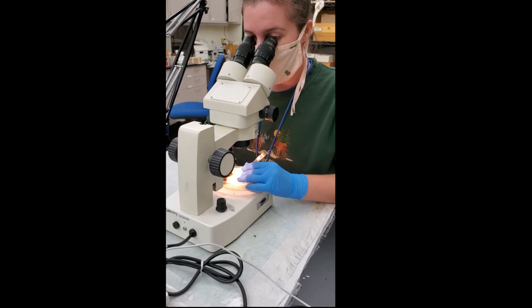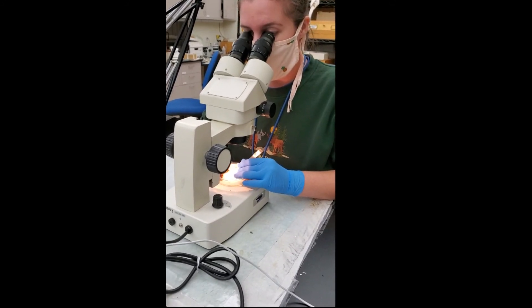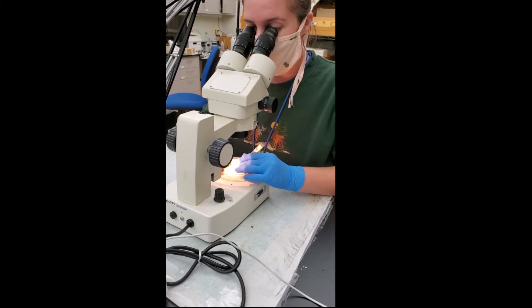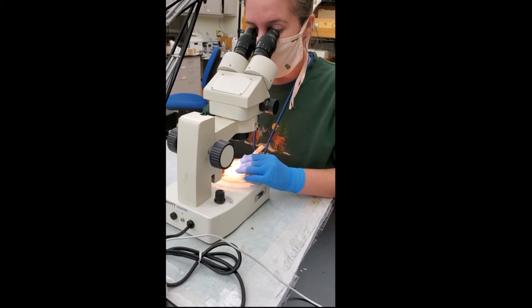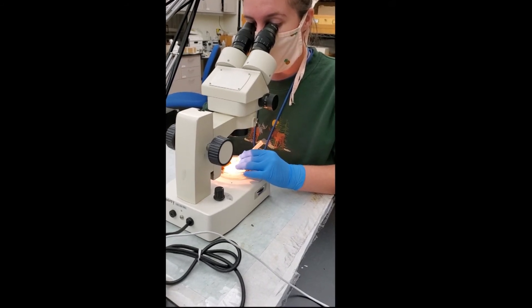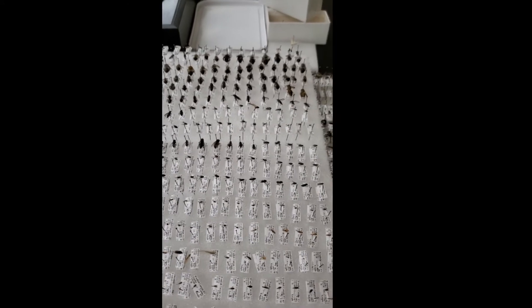Here, one of our employees is sorting through moth samples and determining if the moths are ones that we're worried about. The moth we're looking for is a bad pest on vegetable crops. You can see we get lots of insects in the trap.